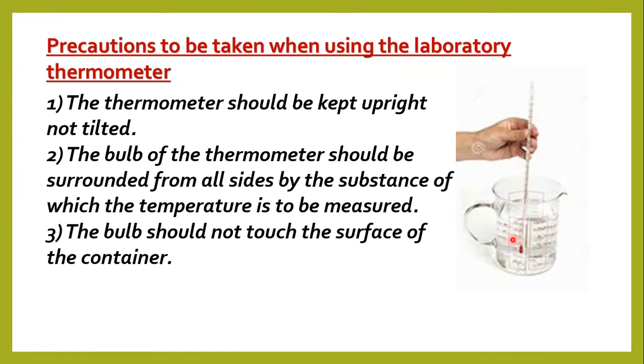Then we're saying that make sure the bulb does not touch the surface of the container. Can you guess the reason? Yes, the body of the container is usually at a different temperature compared with the substance whose temperature you want to measure.